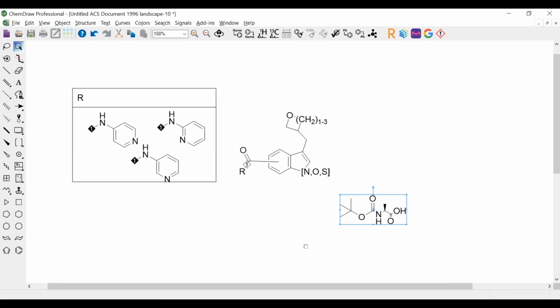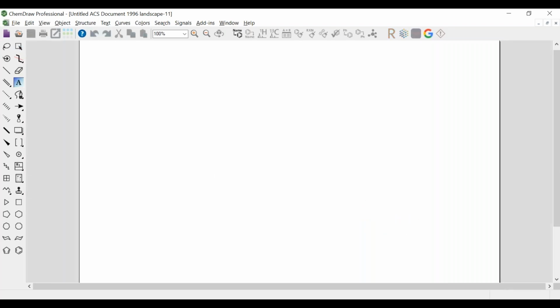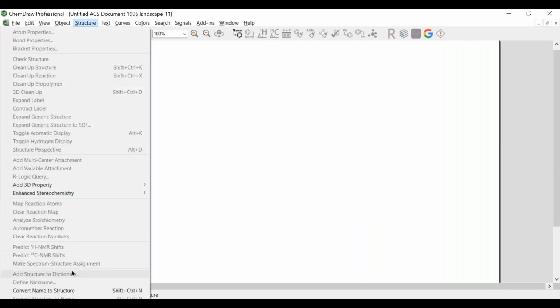That's right. And then an additional thing for that as well is you can save that as an actual name to be saved in our database, that entire structure, and you can collapse that into a label, or you can expand it to the full structure as well. Correct. So yeah, there are basically nicknames and then add structures.